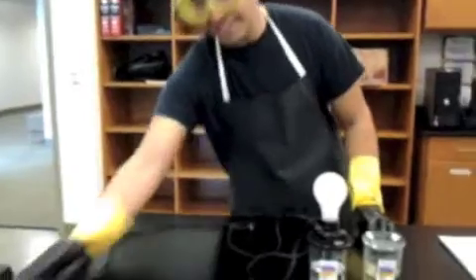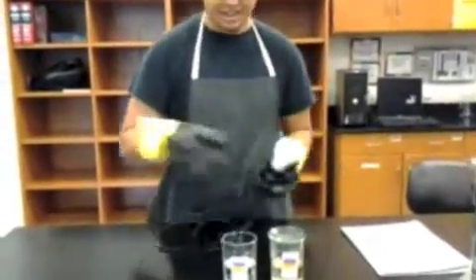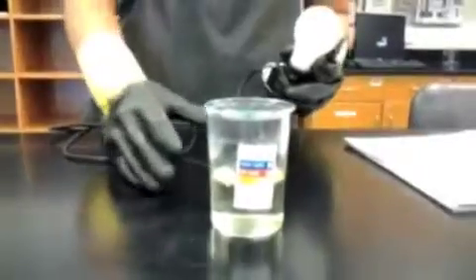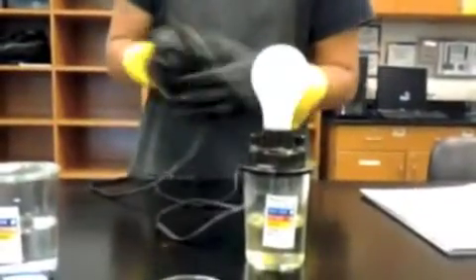So, safety again, disconnect and then remove the light bulb, and then for another safety precaution, move it over to the side. Now we will perform the experiment using magnesium chloride. And as before, remove the disc off the solution, and then put the 75-watt light bulb into it first, and then plug it into the outlet.